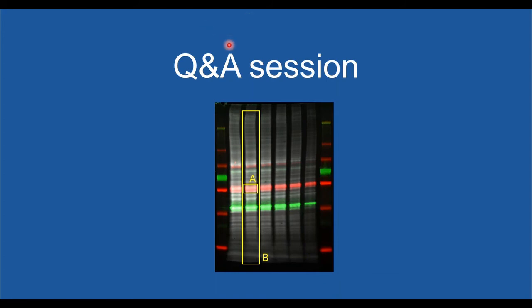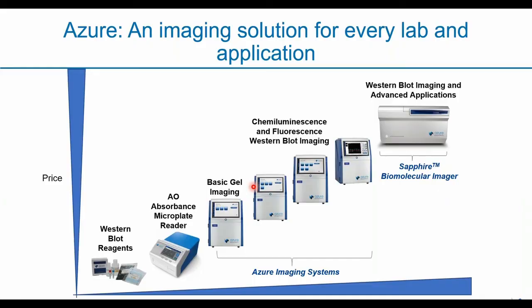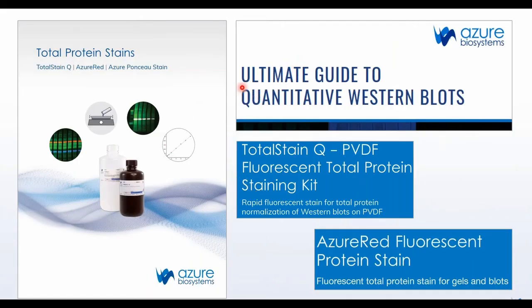Okay, let me go on with the slide. I think it will be easier that way, so I can answer the question. So these are the guidebooks and also some other guides. If you're interested in total protein stain, how it works and everything, you can check them out. It's all available on our website, or you can ask Kevin and Ting Ting, and they can send you or direct you to the link. These you can actually download right now in the handouts section.